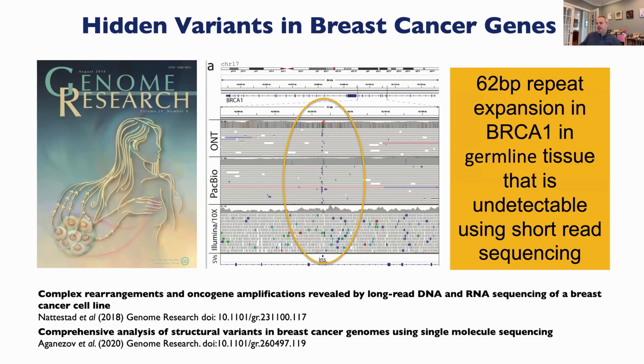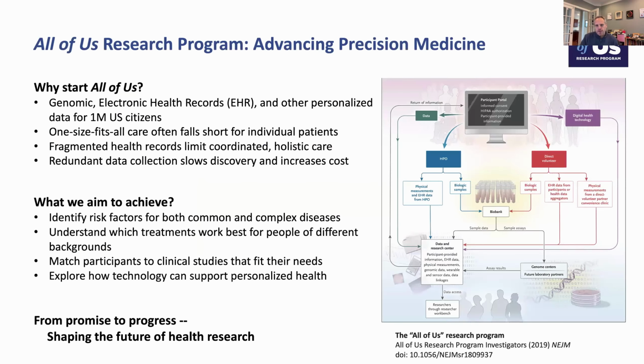But I'm very excited to say, thanks to the All of Us initiative in the United States, we're able to do this at a population scale, at a biobank setting for the very first time. So this has been a dream of mine, to move beyond these individual cases and to be able to do this systematic study looking at truly population scale using HiFi sequencing.